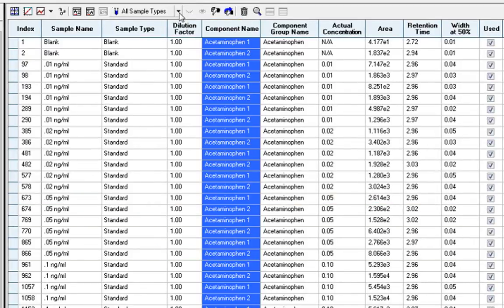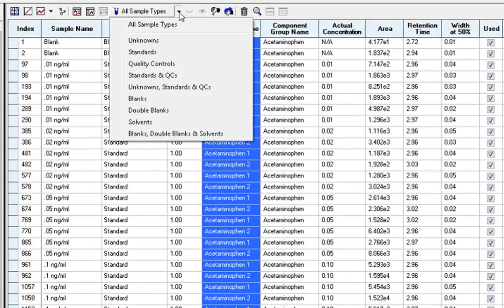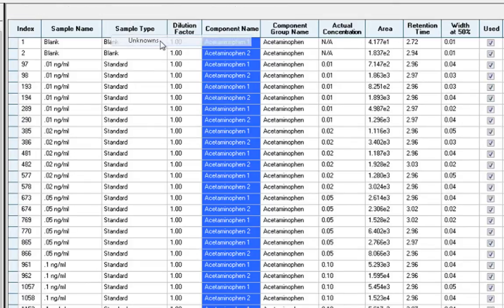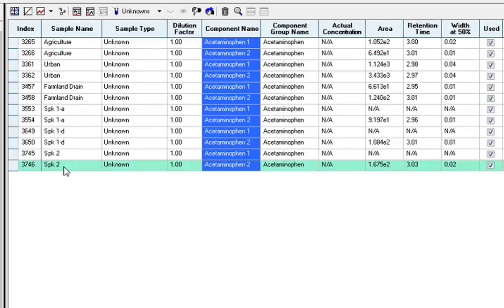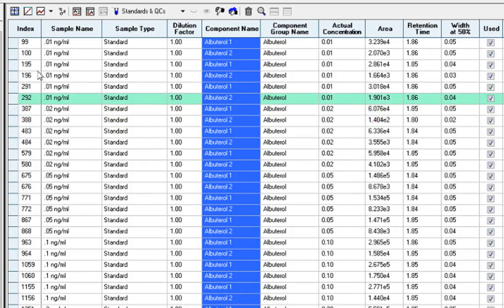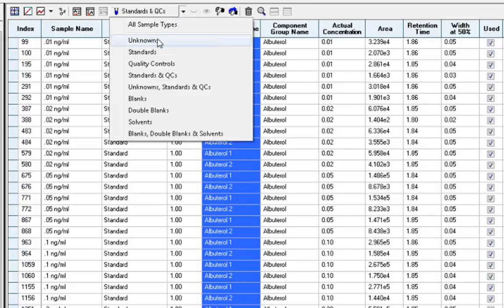The results table can also be sorted by sample type. If you would like to just look at unknown samples, then unknowns can be selected and the table updates to only display those samples from the batch. We will go back and display all samples.